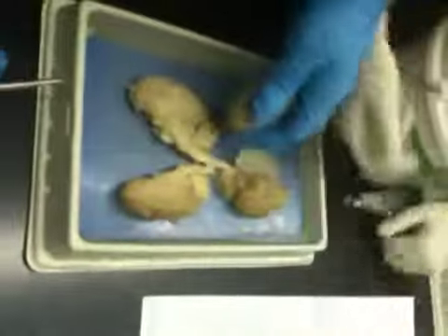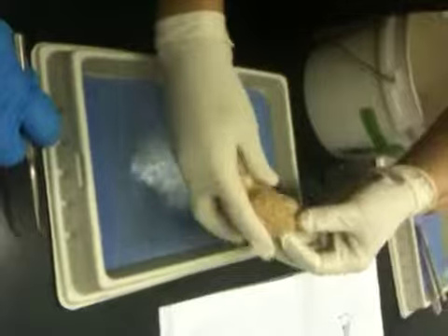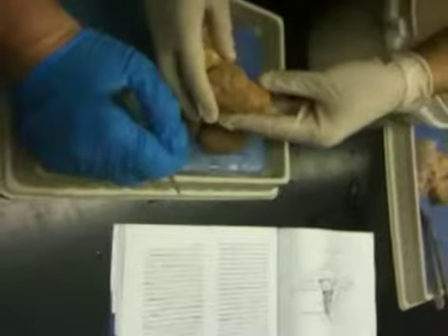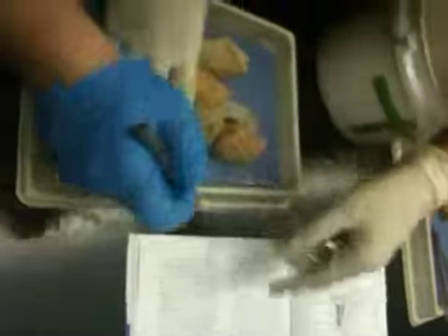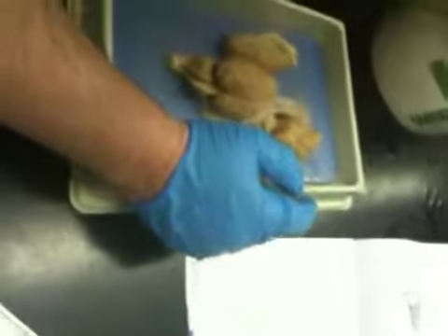How do they not say the thalamus here? I don't understand how you missed that. Are you looking for the thalamus right now? Hypothalamus and thalamus can be basically connected, right? Look, where's the lateral ventricle, by the way? We still haven't found that in the olfactory lobes. It says lateral ventricles. Two lateral ones.